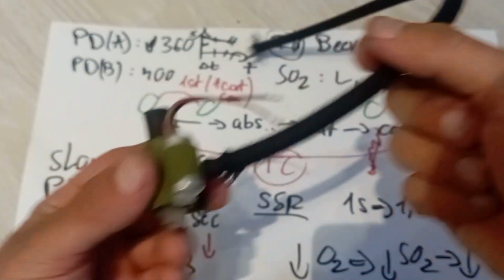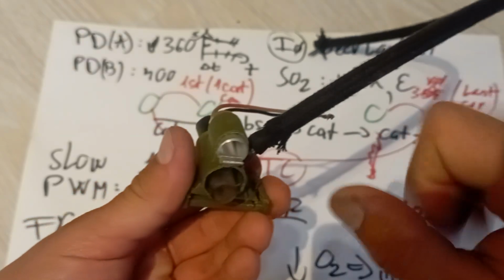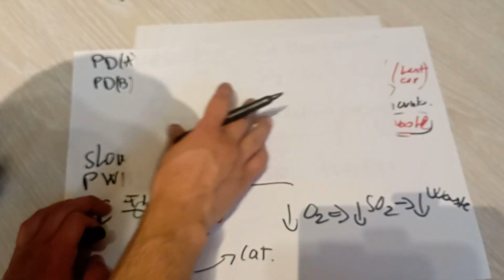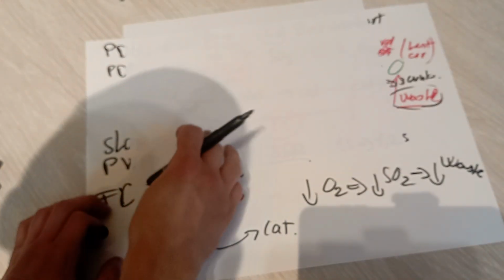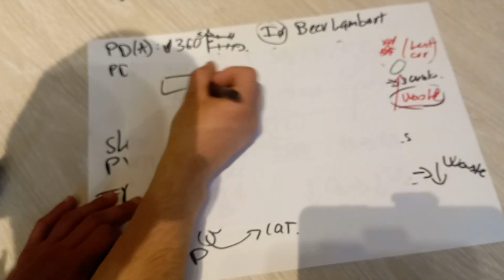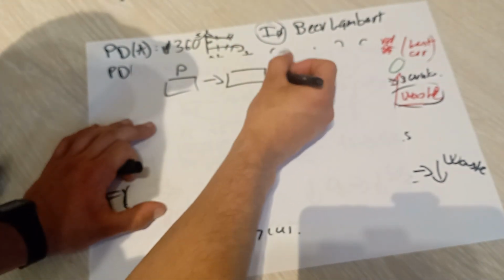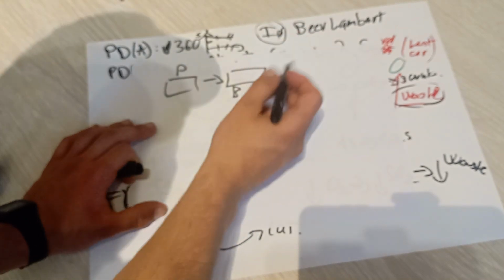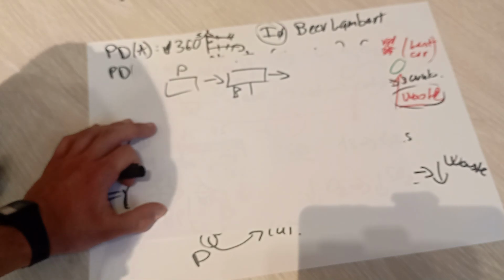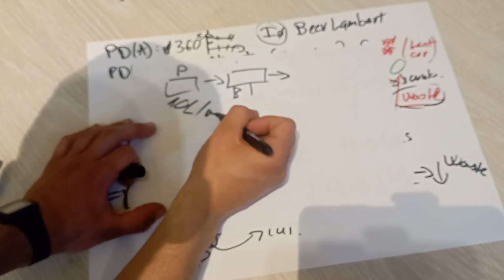And this is another feature. This is just a long tubing. I will add another Y joint here to split this. We are emitting some air because of the system drawn here, so this is the system here, but before it comes here there is a pump. So there is a pump, there is a buffer, and here there is a valve that emits air, because the pump makes more. This is a 10 liter per min pump.